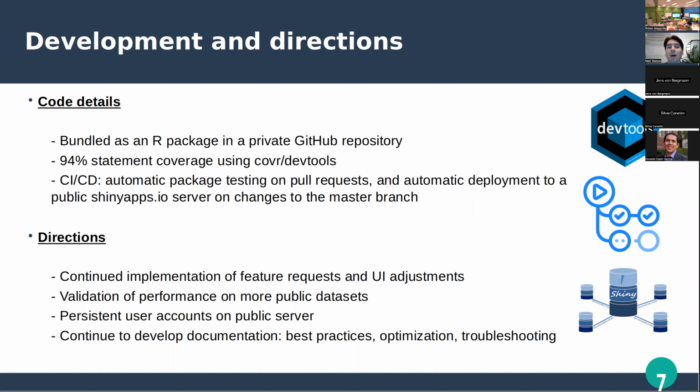We also employ continuous integration and deployment. Our current strategy for integrating new features is to merge pull requests, and we have automatic package testing on those pull requests. Anytime we make changes to our master production branch, we also have an automatic deployment script to a public server.